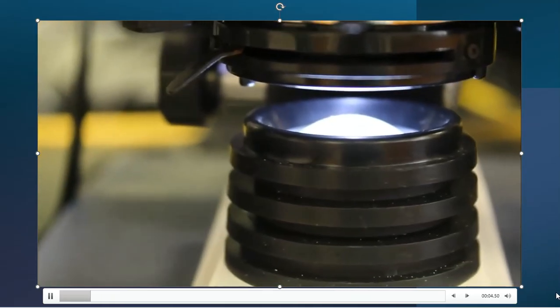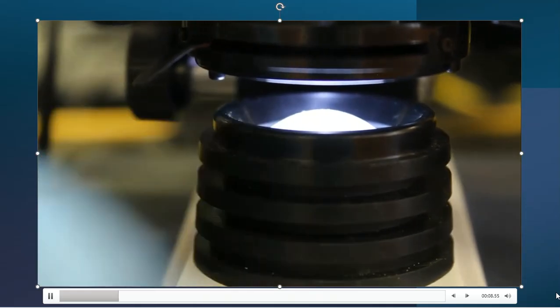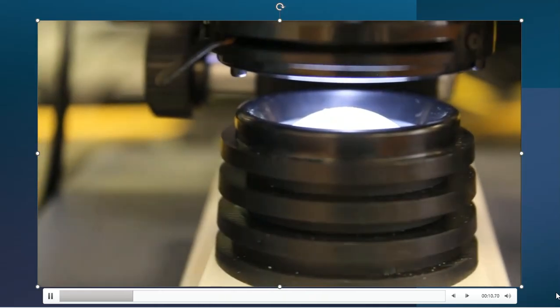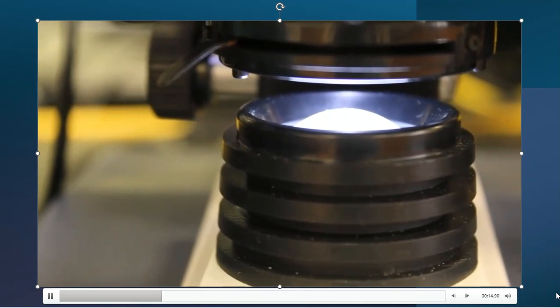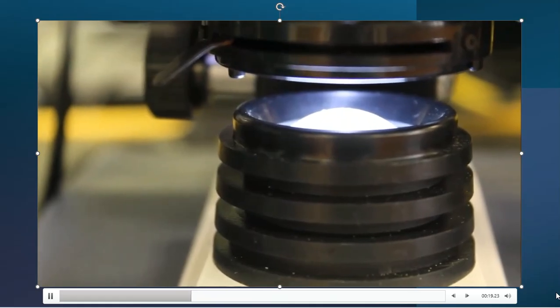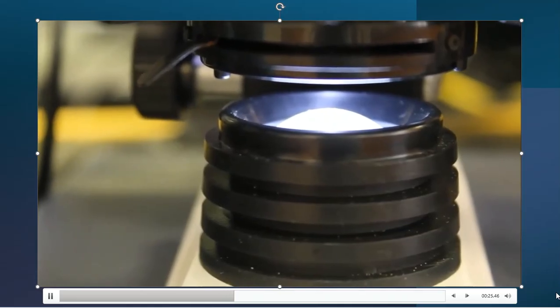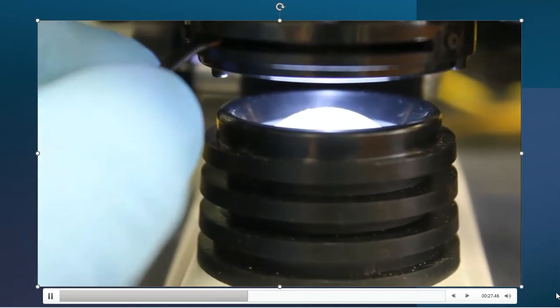All right, so the reason that I'm showing you this part of the microscope, this is where the light is coming from, and I just referenced that I didn't have enough light on the high-powered lens for it to show up an image. And I told you that I turned the bulb up. So I just took a picture of the brightness that we can manually dial and turn the bulb up a little bit brighter, but I also have control of it here.